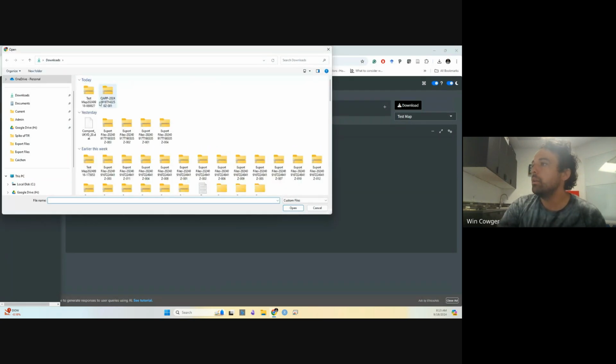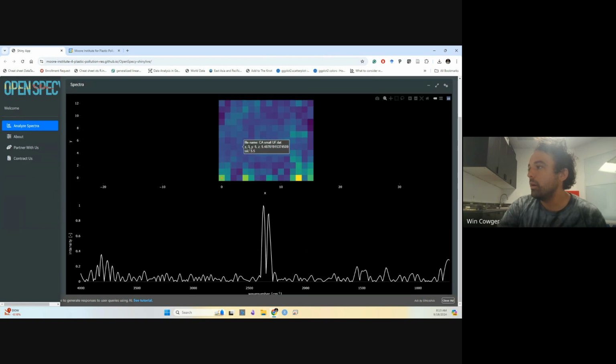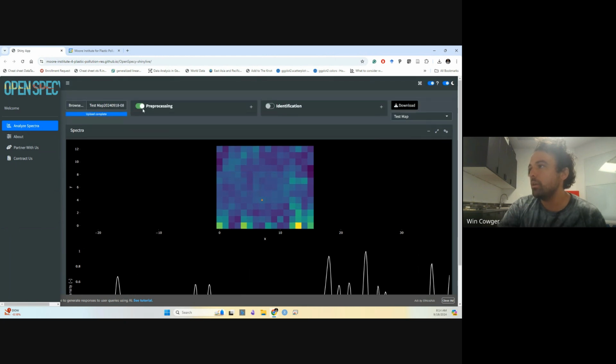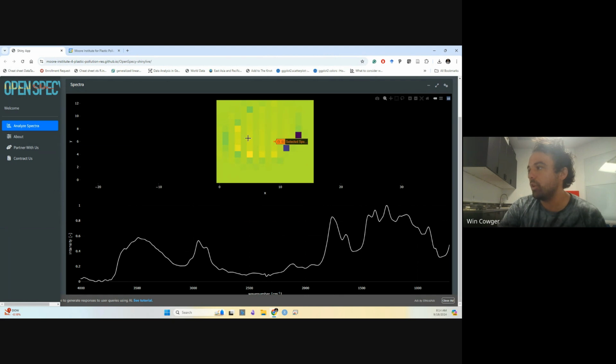But so I'm going to upload the test map here. And I'm just going to click around here just to see. It looks like pre-processing is working for me in my version of Chrome right now. Yeah, and that button is working.